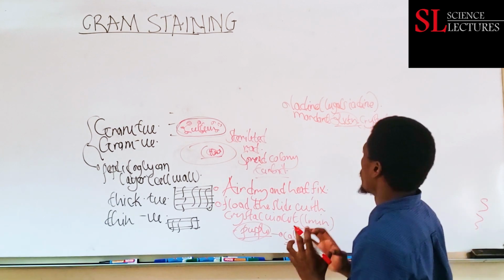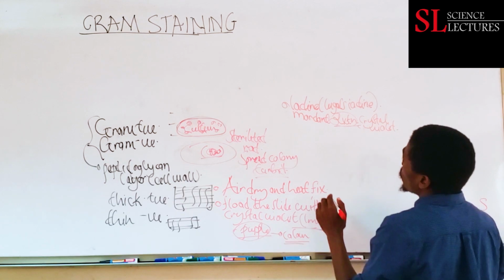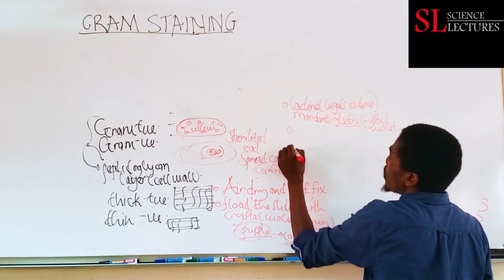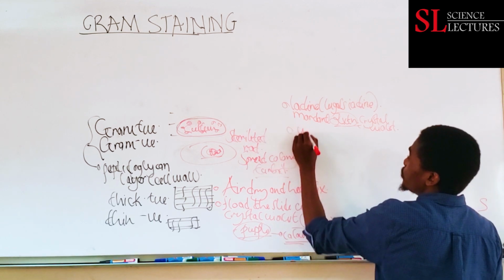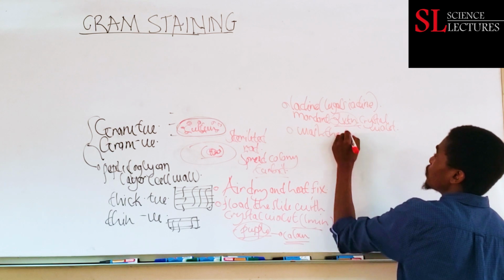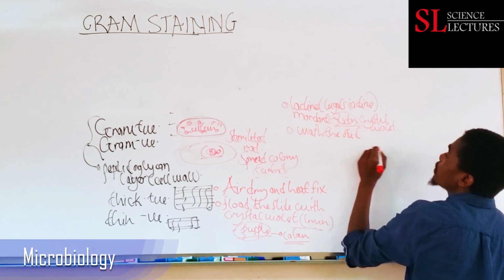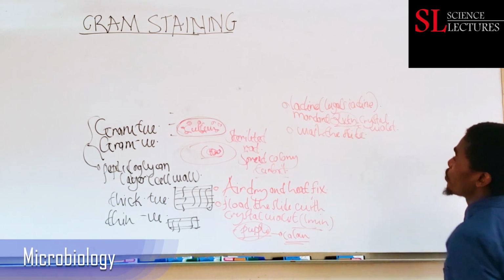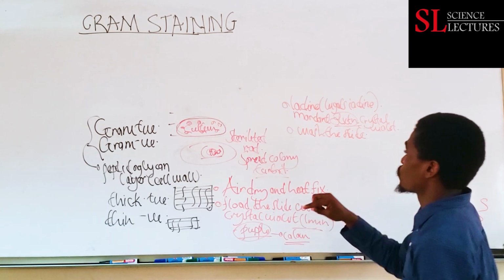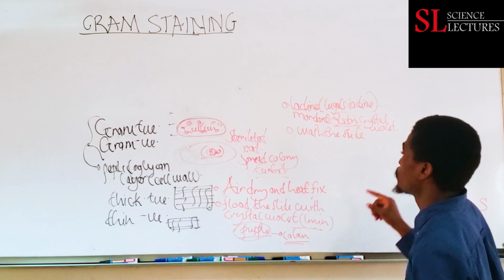So that is iodine being used as a mordant. Then after adding iodine, we wash the slide. The washing helps in removing the excess iodine, so you wash with water to remove the excess iodine.